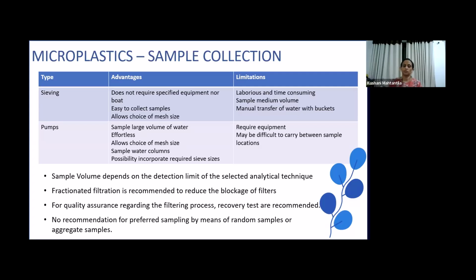We sample a medium volume of water and we have to transfer the water with buckets. However, when we want to sample a water column, we cannot use the sieves or nets. Then the only option is pumps. For the particular depth we want, we can employ the pump and sample the water. In addition, it allows the choice of different mesh sizes.